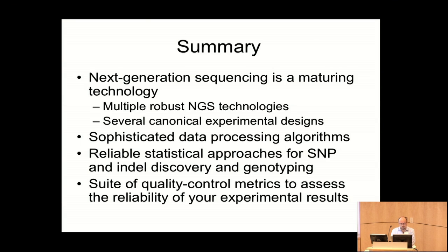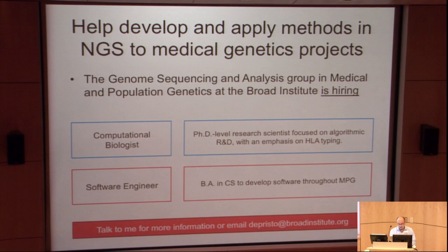And I couldn't recommend more strongly to have a look at some of the tools in the GATK that do these analyses for you automatically. If you have new data sets, take a look at the quality of the calls that you're working with. Maybe it's possible to improve them or to add more calls. Maybe you're being too stringent. You can change the data sets and potentially reduce the number of headaches you'll have in the future or add more opportunities.